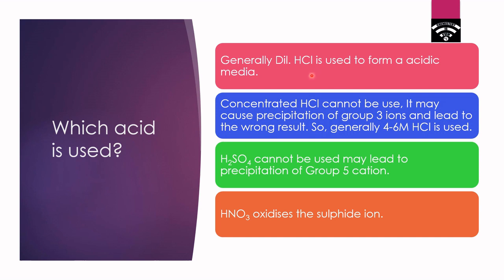Concentrated HCl cannot be used, as it may cause precipitation of Group 3 ions and lead to wrong results. We generally use 4 to 6 molar HCl. H2SO4 cannot be used because, in Group 5, calcium ion is present, and using H2SO4 may cause precipitation of CaSO4, leading to wrong results. HNO3 also cannot be used because it is a strong oxidizer — it will oxidize the sulfide ion and form colloidal sulfur, so there will be no precipitation of the sulfides of the cations.